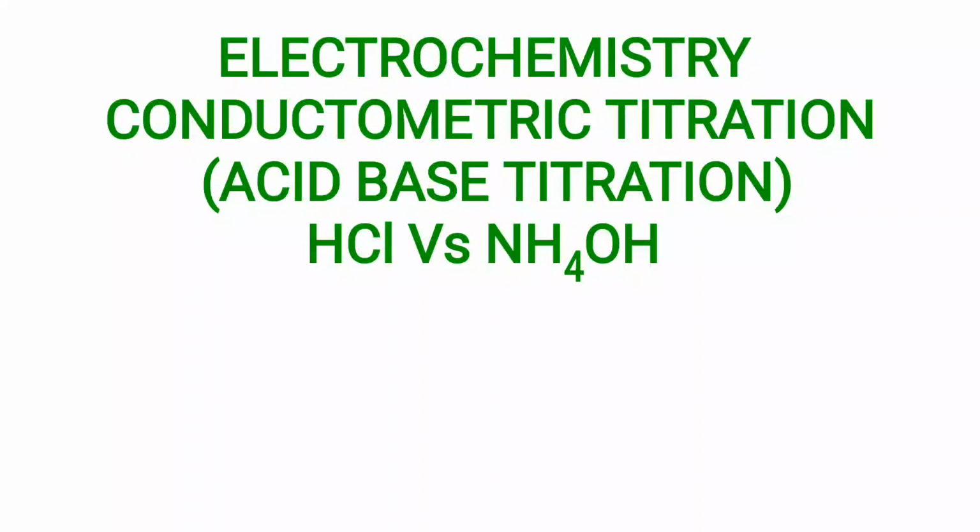Today in this video we are going to discuss the topic of electrochemistry, conductometric titration, acid-base titration in the case of strong acid versus weak base. Acid-base titration, strong acid with strong base, weak acid with strong base, and a mixture of acids versus strong base, these topics we have already seen in the previous video. Now let us come to the practical session.